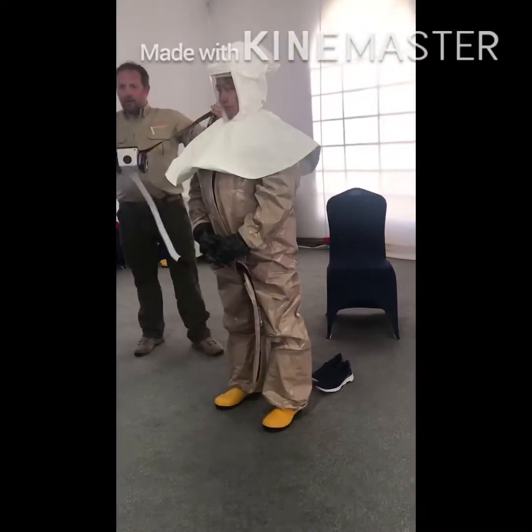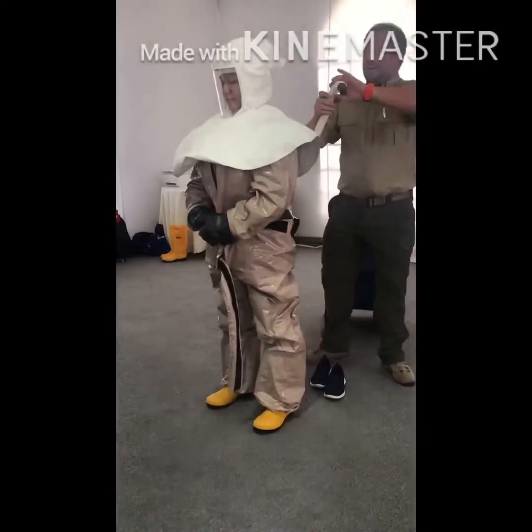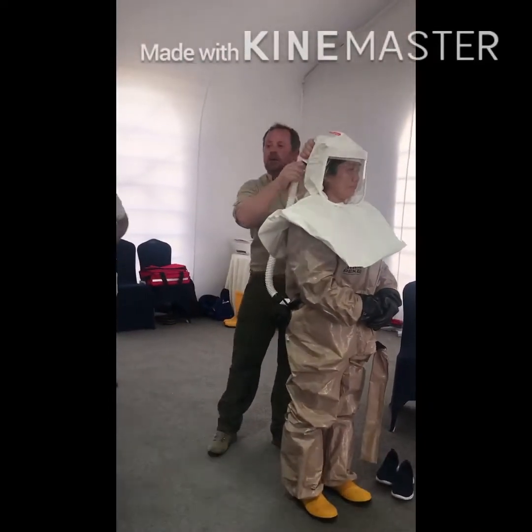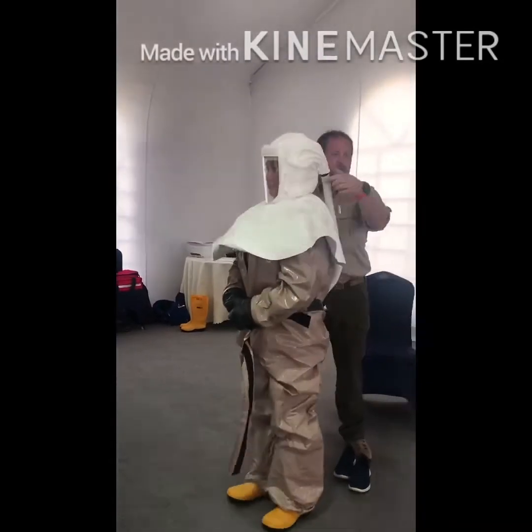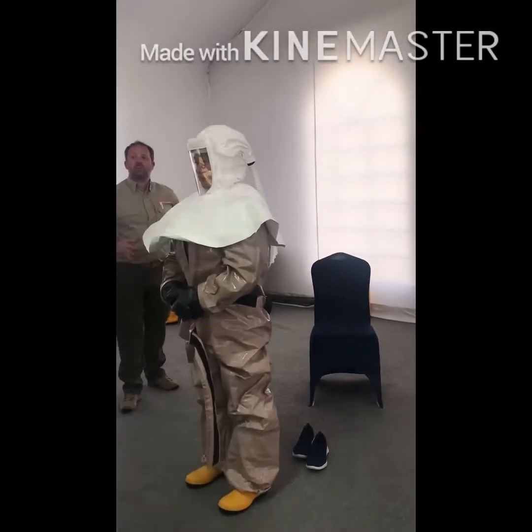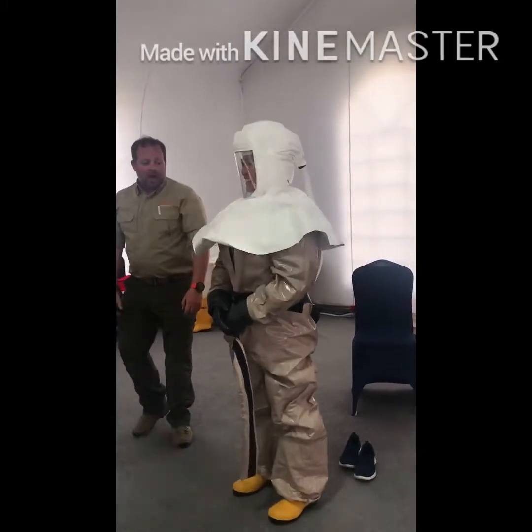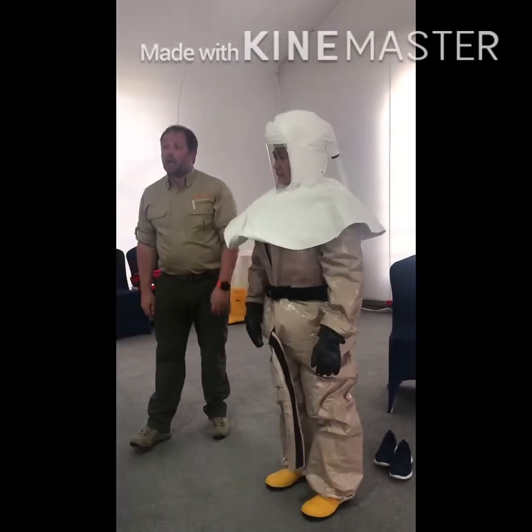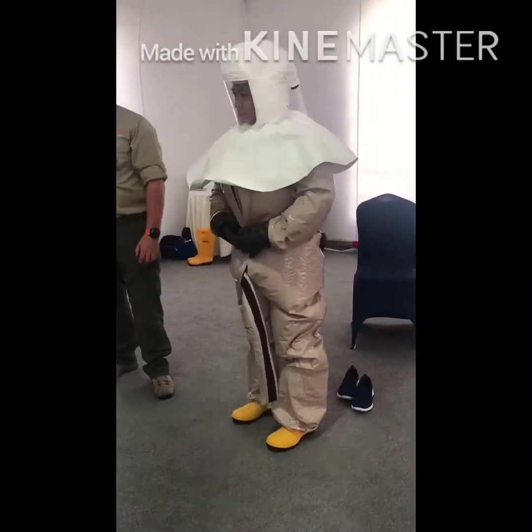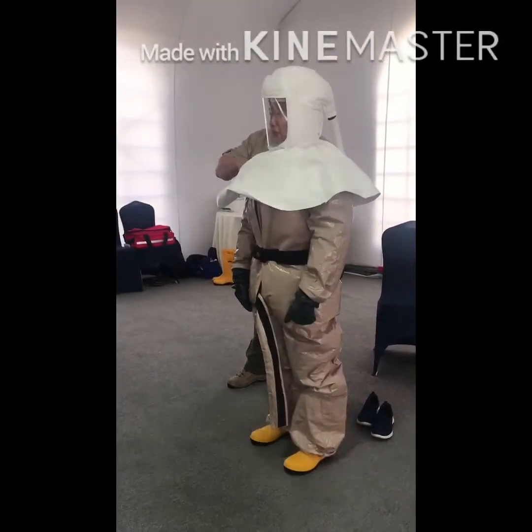Once that's done, I'm going to attach my PAPR. And then I take, can you just turn around for me? Take the end pipe, push that into the receptacle at the end. Okay, so that. And then turn it on. What you'll see now is it'll inflate. And if you watch the suit as well, you'll start to see air coming into the suit. That's her now, completely covered.